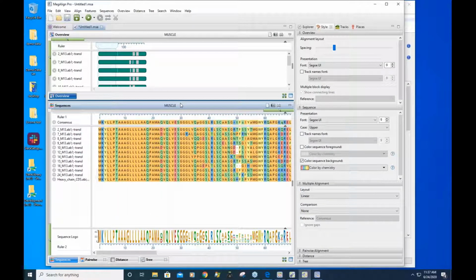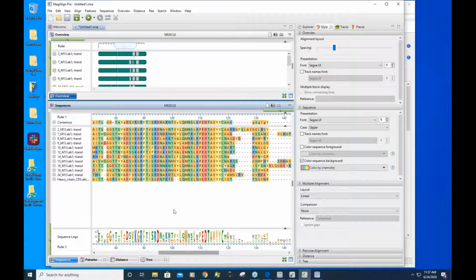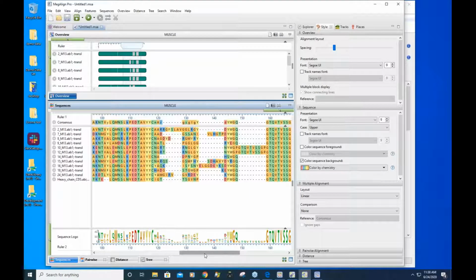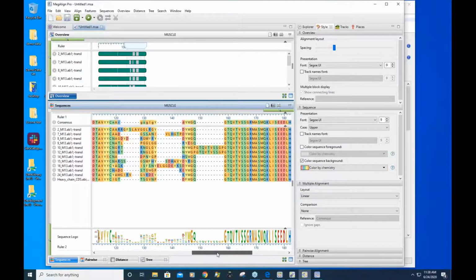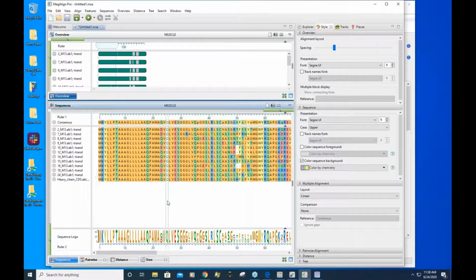After you have done the alignment, what I want to do is check the alignment to make sure there's no major misalignment that happened. You can see in the beginning, you got a very tight alignment. And then once you scroll through towards the middle and end of the sequence, you can see there's a lot of mismatches. This is really what I would expect to see. Again, I'm dealing with the variable region of the antibody sequence, so that's really what I expect. And then towards the end, you got a really tight alignment, looks clean. So I would say the alignment overall looks pretty good.